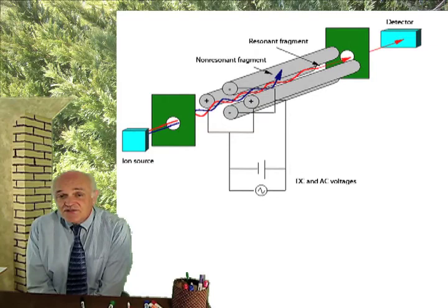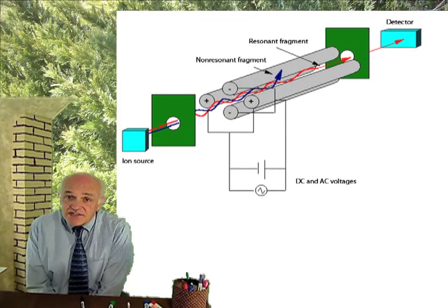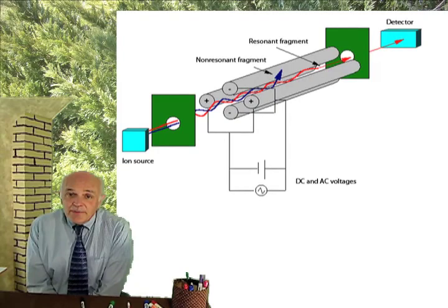These numbers are dropped into boxes. The engineers have designed the filter to match up the boxes in a very reproducible fashion, so that in a very short amount of time, the mass spec produces an absolutely incredibly large amount of data.